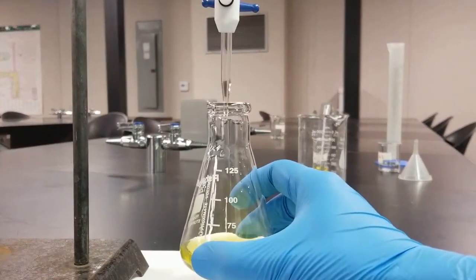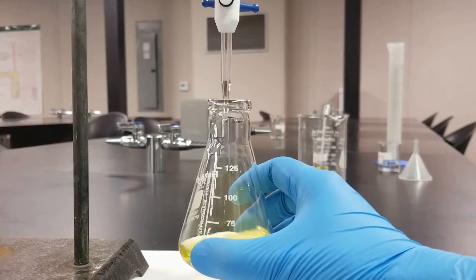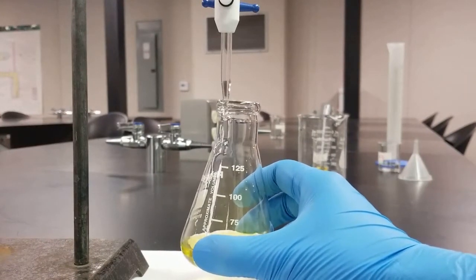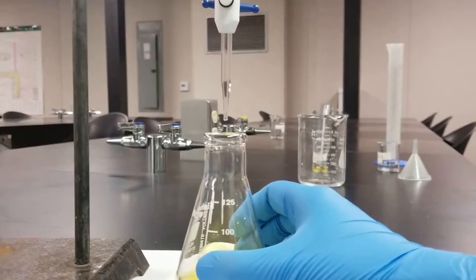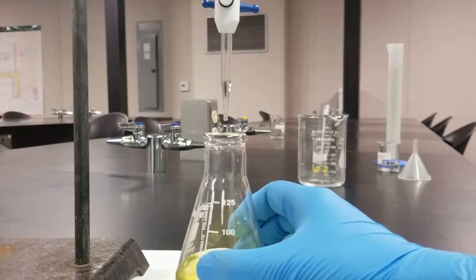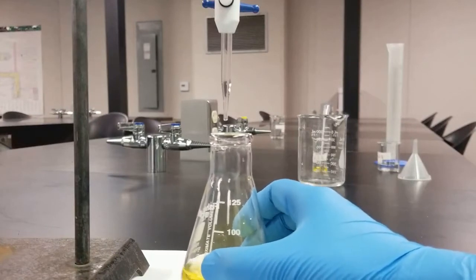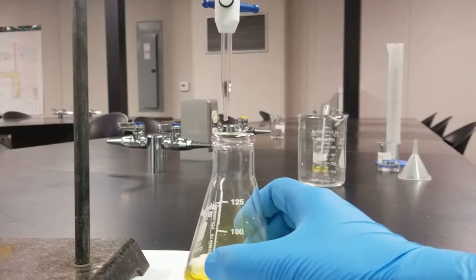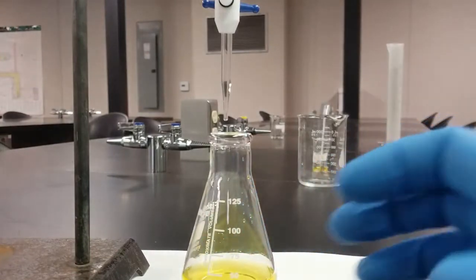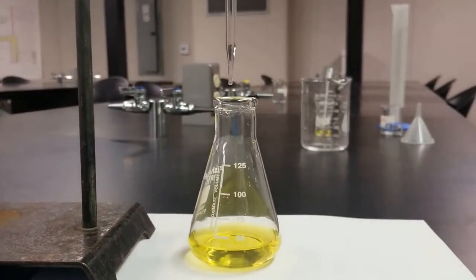I see a lot of students kind of go like this. The issue there is if you're not swirling carefully, you're going to make contact with the burette and you might actually break it off. So I like to leave a little headspace. That way, if I over stir, I just mess up my experiment instead of breaking the equipment. So I'm going to go ahead and start titrating away.